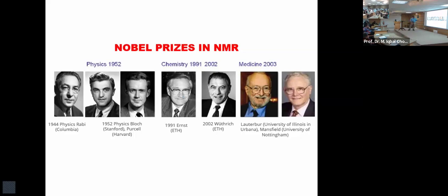So doctors didn't really want to be left behind, and they thought, if they can use NMR for the detection of organic molecules and for proteins and nucleic acids, why can't we use NMR spectroscopy for detection of molecules which are present in the body, in living organisms?